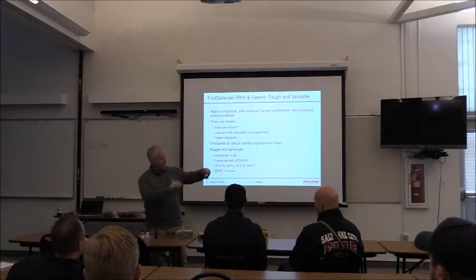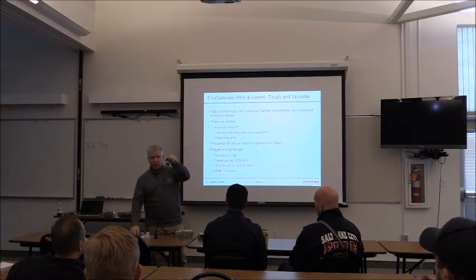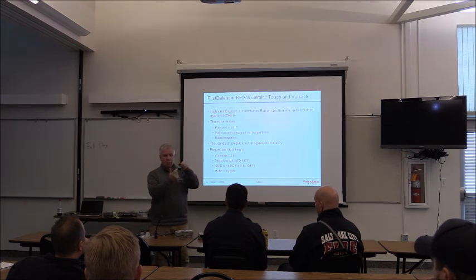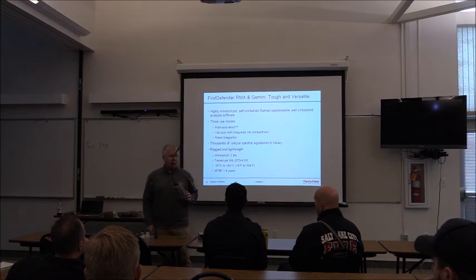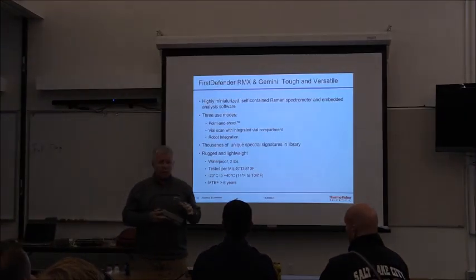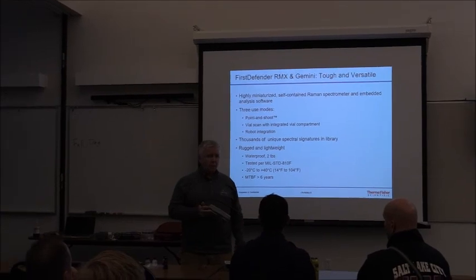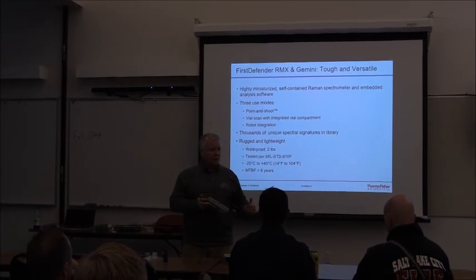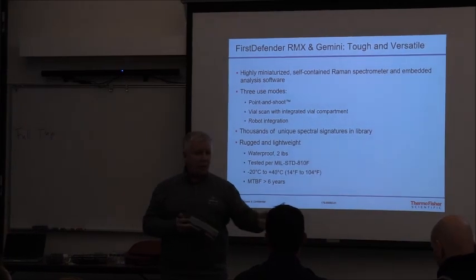The laser pointer goes to a product, right? Can I get a laser through the glass? Sure, right? I can shoot the laser through the glass. So one of the huge advantages of Raman is that it will go through containers. But the question most people have is, well, what will it go through? It needs to be able to see the product. In other words, I need to be able to see the product.